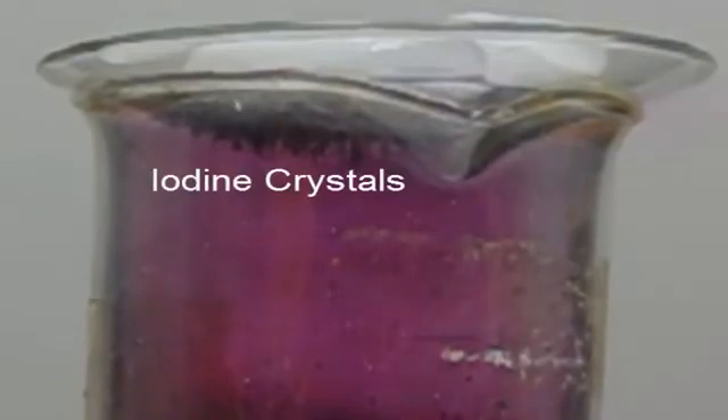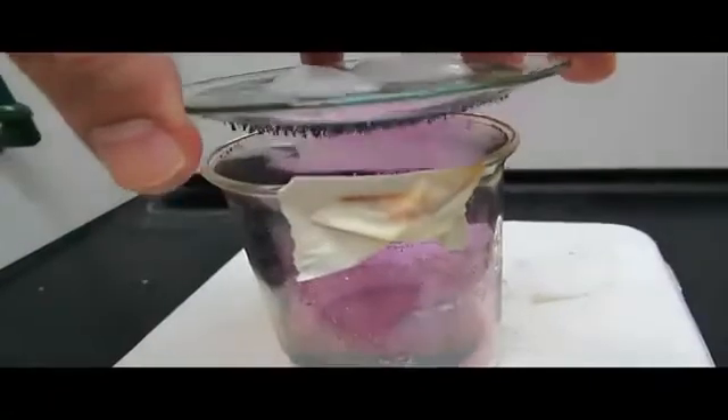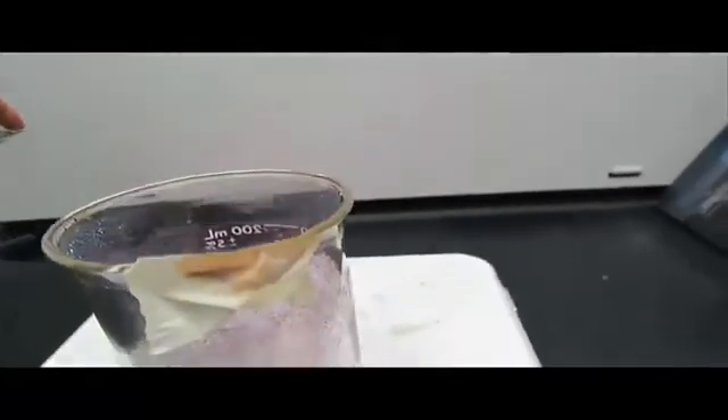If we were to take that watch glass off and look at the crystals, they'd look something like this. Here I'm actually taking the watch glass off — you can see the iodine gas escaping — and then you can see those iodine crystals there.